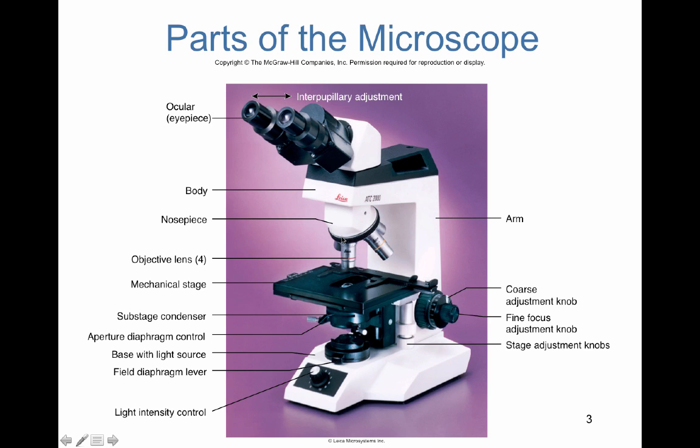So you have the rotating or revolving nose piece with each objective lens. There should be 4, and the magnification potential is a little different on the monocular, but on the basic compound light microscope, it goes up to 1,000. So the highest magnification of this instrument is 1,000 times the actual size of that object. And usually at the higher magnification, you require immersion oil to make contact with the slide and the lens to provide for this greater resolution.